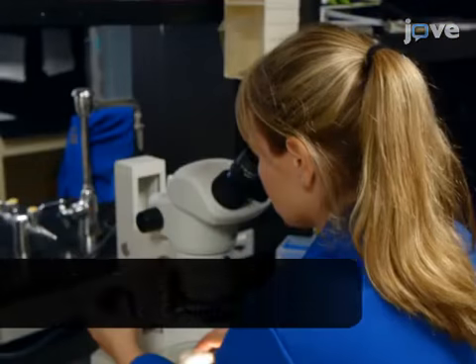The main advantage of this technique over existing methods, such as rodent models or cell culture assays, is that we can assess the aneuploidicity and germline toxicity of chemicals in a whole animal model, while at the same time performing a high-throughput assay. Performing the procedure today will be the postdoctoral fellow, Dr. Daniela Parodi.